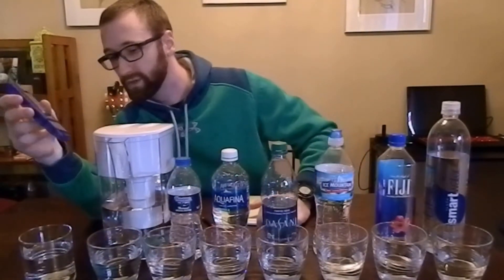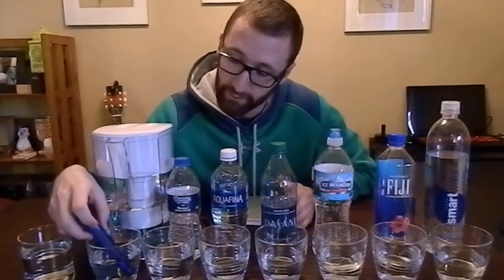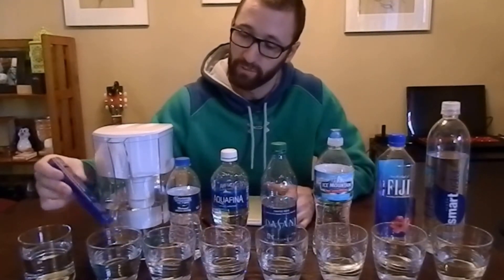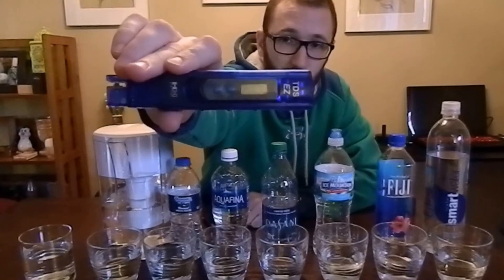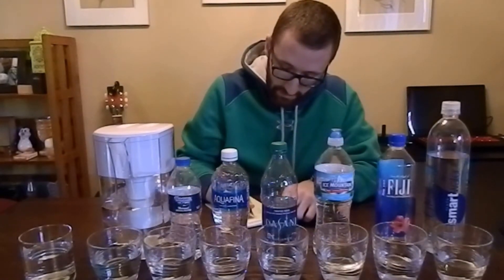Here is the same tap water that we just tested at 400, now run through a Brita filter pitcher which you just keep in the fridge. A lot of people have them. I was curious to see how effective these Brita pitchers actually are in filtering water. It reads 243 ppm — we went from 400 down to 243. That's not too bad; that's definitely filtering, we can say that much.